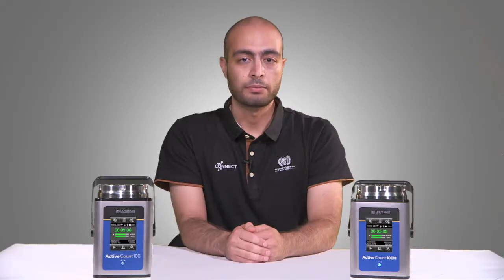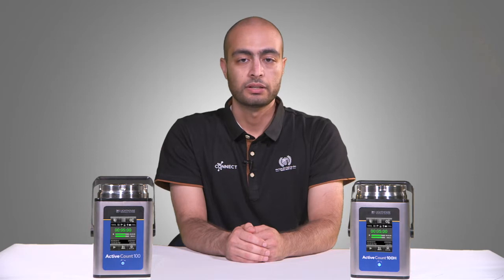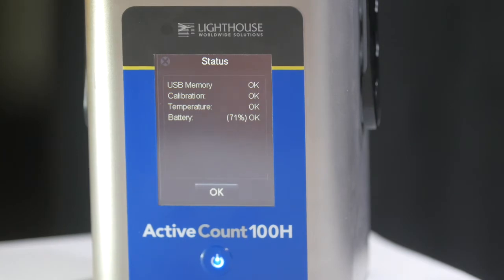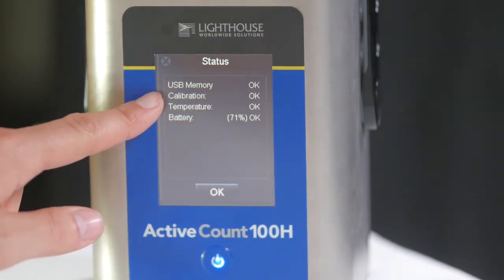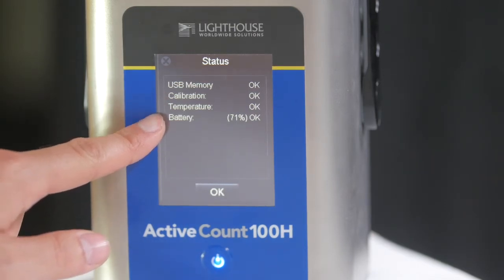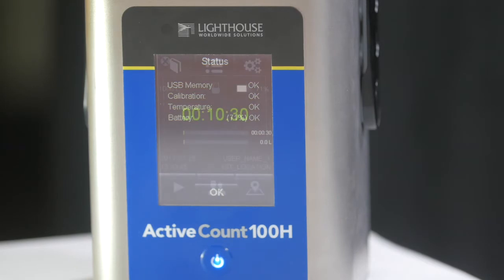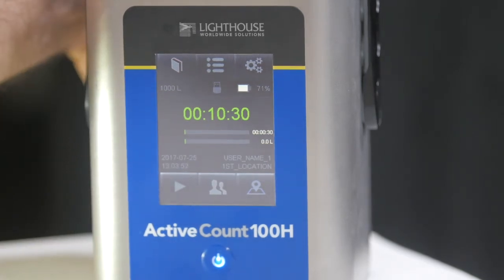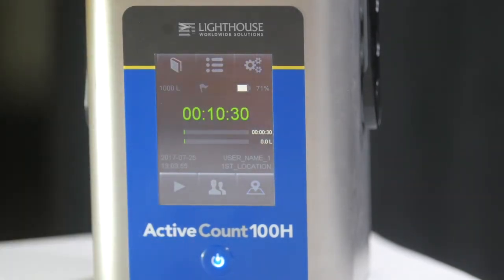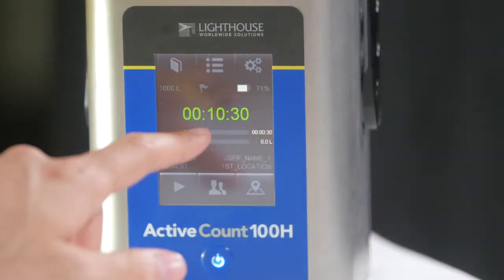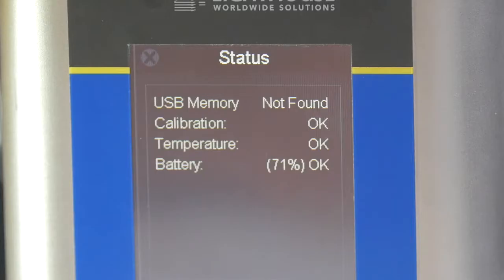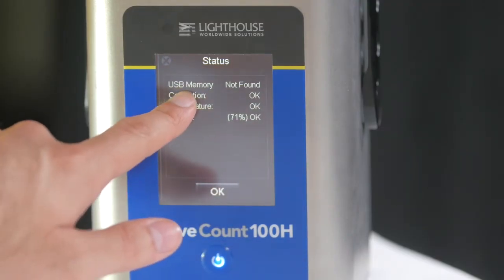Next, we have the status screen. If at any point you find a flag icon appear on the main screen, you will enter the status screen to find out the reason for the warning. Here we have diagnostics for USB memory, calibration, temperature, and battery health. For example, if I remove the USB flash memory, I will see a flag icon appear on the screen. Go back to the settings menu, click on the status screen, and it will indicate the cause of the warning — here it says the USB memory is not found.